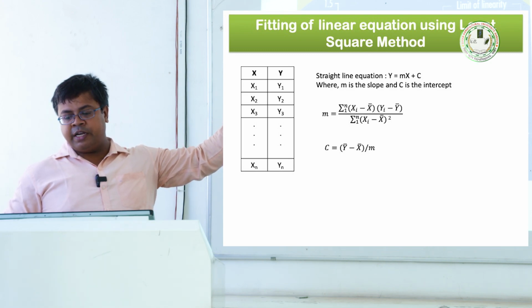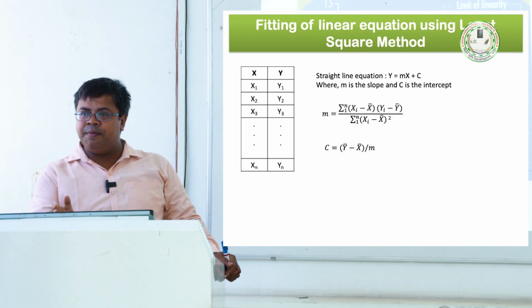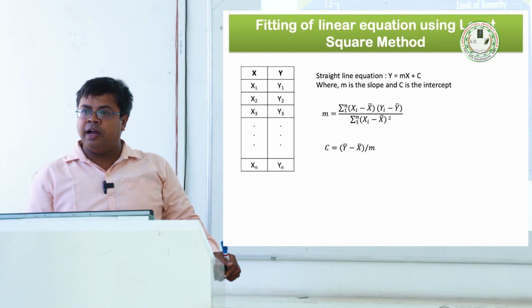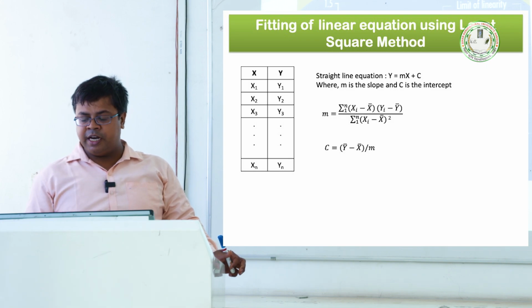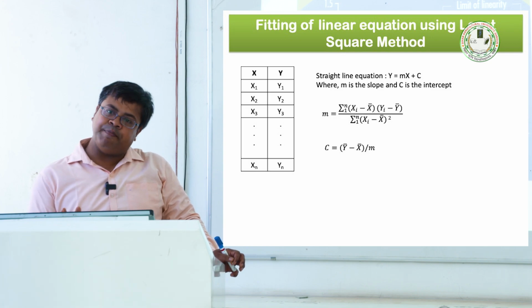You see that point as the limit of linearity. That means up to 10 ppm we can measure, or this standard curve can be applicable for determining unknown samples having a concentration of up to 10 ppm.